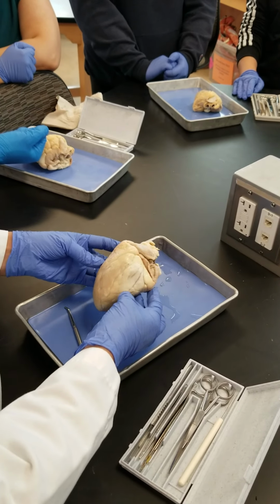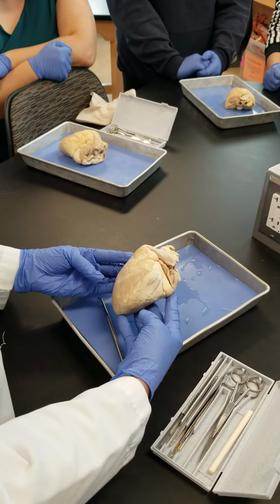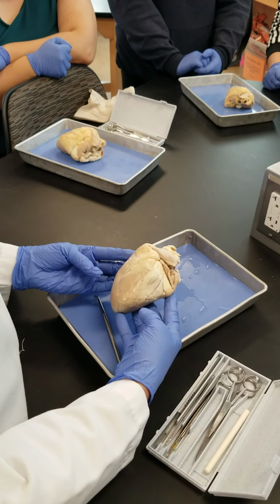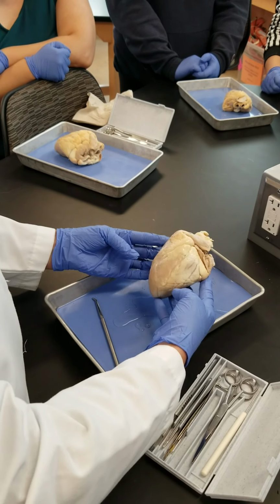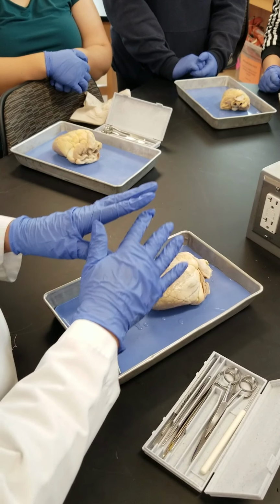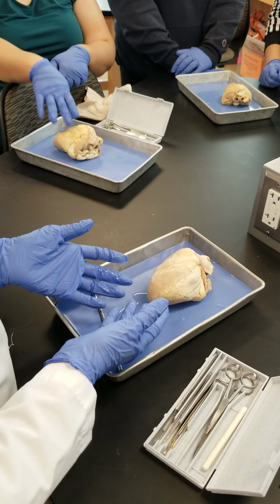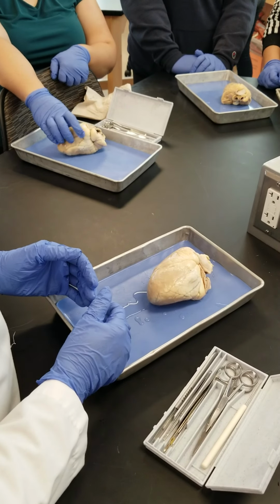So here, we have a sheep heart, and we want to dissect it, and later you will be asked in your practical exam, right? So we have to know everything about that. To review all the things that you have in the list, first we need to go from the outside of the heart and recognize the structures that we can see from the outside. Then we cut it, and then we go to see inside of the heart, right?